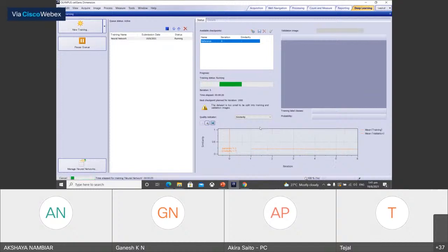But for the neural network creation, there is one factor called similarity. There is a validation going on during the creation to see whether the neural network is created well or not. If it becomes close to 1, then the neural network is created well.